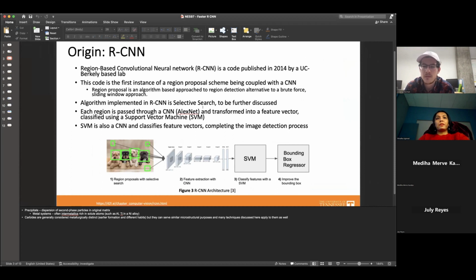Correct. So any idea? This is a very classic thing that I did in the activity in the class. You have an image, it extracts the features. After the features, it goes to a fully connected layer, which is composed of neurons.